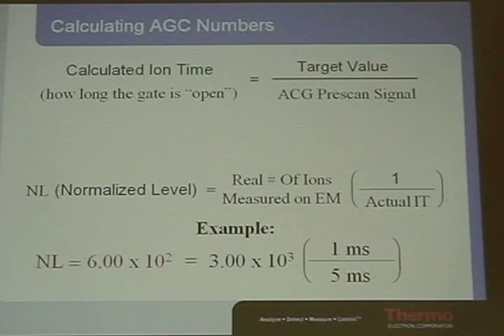The problem is when we dig down in the grass to find your real small guys, we take long times to do that, and we get fewer MS/MS scans per chromatographic run. So our trade-off is we either can be very sensitive with a lot fewer peptides found, or we can miss the small guys and get a lot more scans of the big guys. That's your trade-off always. Does that make sense?